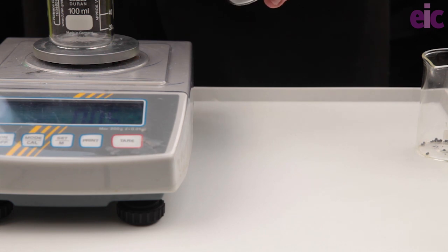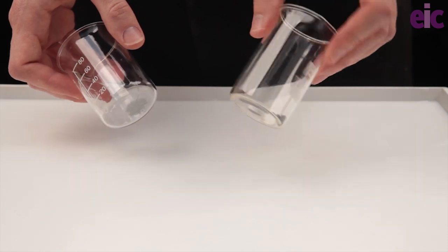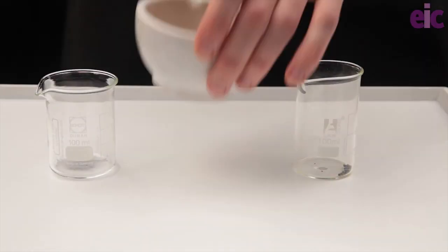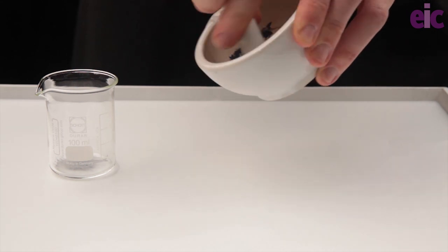Working in a fume cupboard, weigh out 0.1 grams of aluminium powder and 0.4 grams of iodine into separate vessels. Use a small beaker or a weighing boat rather than paper to measure out the iodine. Grind the iodine to a fine powder in a pestle and mortar, but never grind the two powders together.